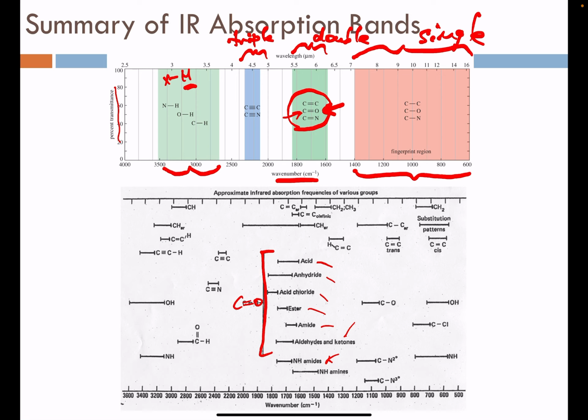And in the case of carboxylic acids, those could be distinguished from esters by looking for the other piece of the acid group, which is, of course, C double bond O tethered to an OH. So the OH, if also found, would help you put together that you have a carboxylic acid in your material. Okay, so again, turning to resources that are tabulated, like those on this slide or other textbooks, can help with the assignments in a spectrum.